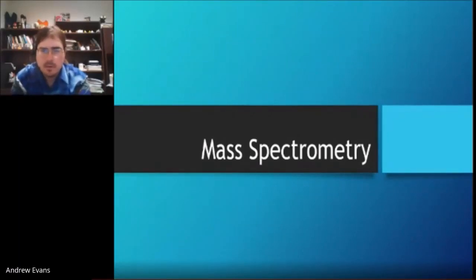Welcome. Today we're going to talk a little bit about mass spec. Mass spectrometry, unlimitedly useful, incredibly difficult sometimes, but we'll go through how it works a little bit and what we can take away from it right away, maybe even how to get a little bit more in-depth information out of it.